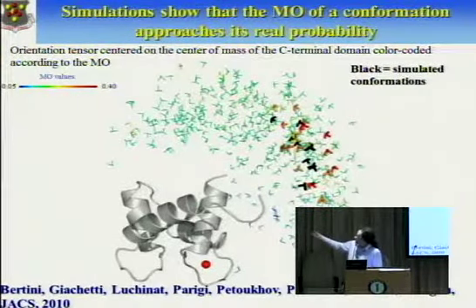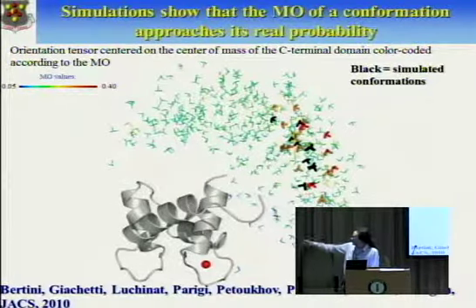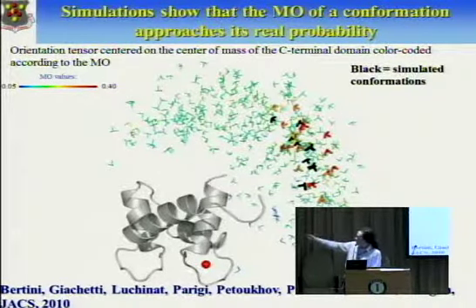And at the end, this is a possible representation that we generate where each structure, sorry, this is the domain where we put the metal, the red ball here, and the other domain can, in the random pool of configurations, span this entire space, and the second domain is represented by a small Cartesian three-axis centered in the center of mass of the domain. So you see that's the span, and this random is just the total.